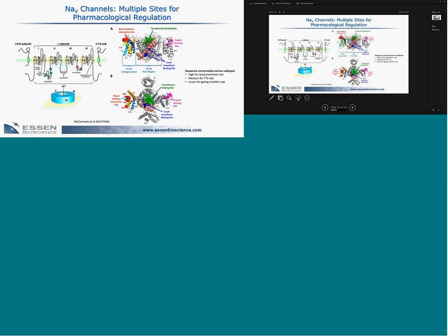And then in contrast, state-dependent blockers would tend to block the 25th pulse better. The example here is tetracaine. I'm sorry, it's just because of the size of the slide, it's not showing up very well. But tetracaine blocks the first pulse much weaker than the 25th pulse, and that's shown in this titration in the middle here, and there's around a tenfold shift for block of the first versus the 25th pulse. So this shows about a tenfold shift. It's consistent with state-dependent block by this local anesthetic.